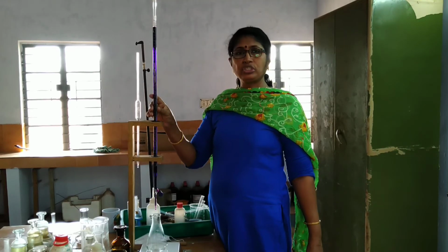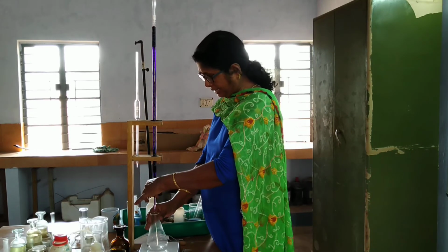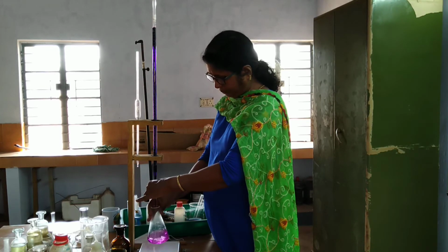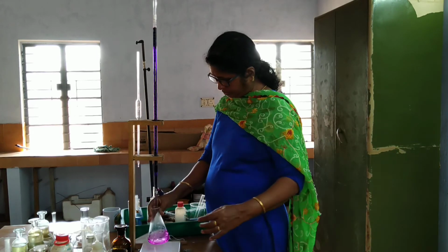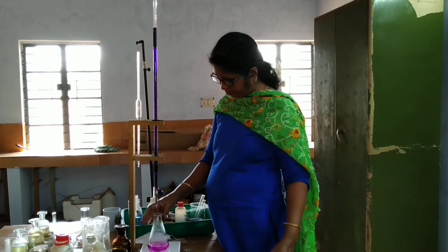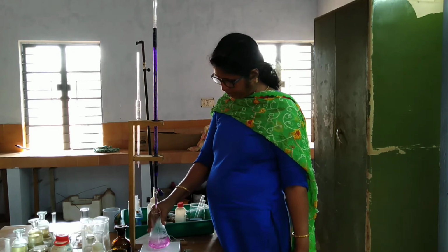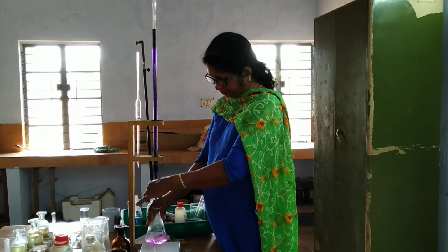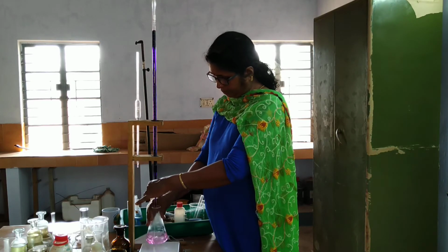I have washed and rinsed the burette and taken the potassium permanganate. Now I am titrating it. See, for the first few drops the color will go very slowly, so you will have to wait for some time. Now the color goes. It will go only very slowly. Next it will be fast. Now you go on adding till you get a permanent pink color.